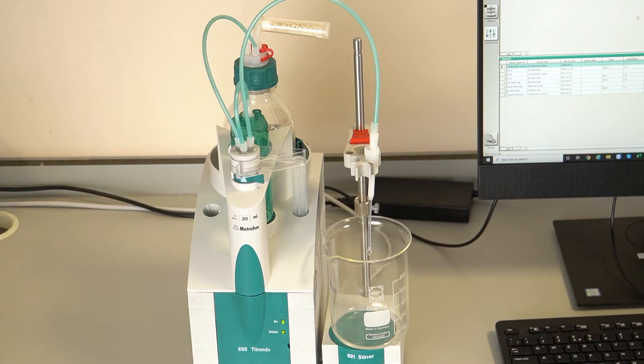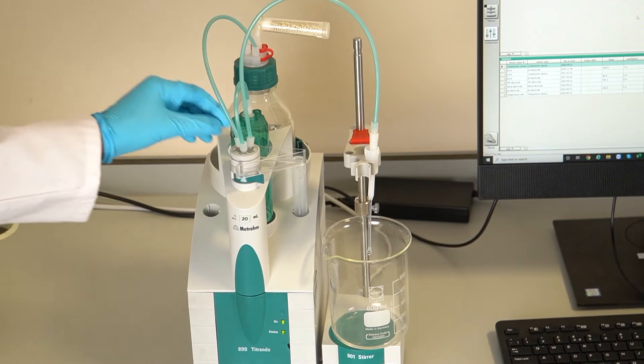Mount a waste beaker on the titration stand and ensure the buret tip is pointing into the beaker. Disconnect the reagent bottle from the buret.